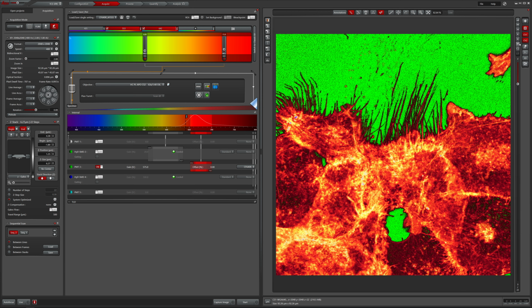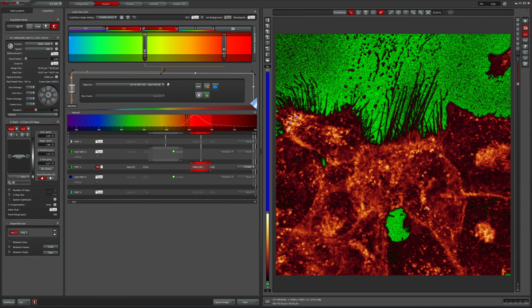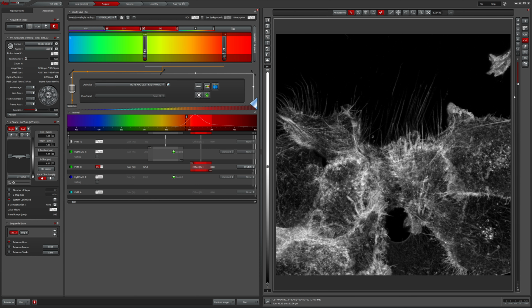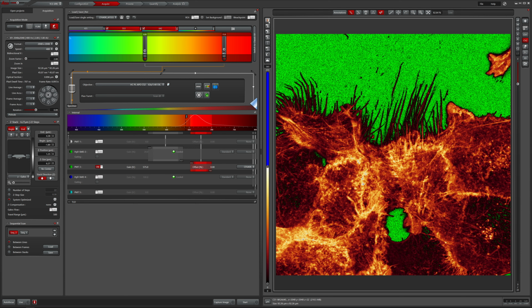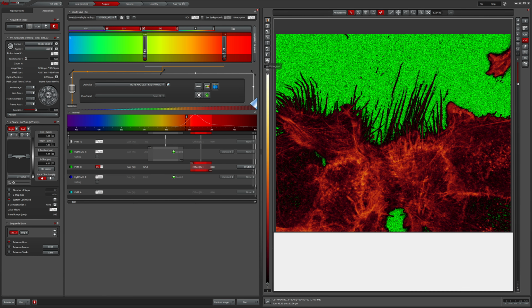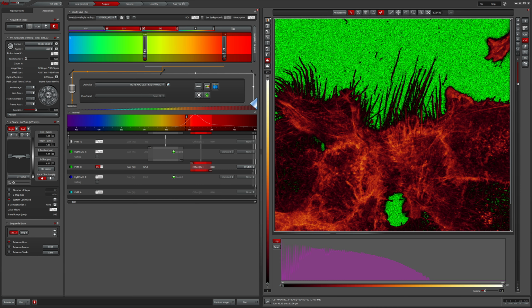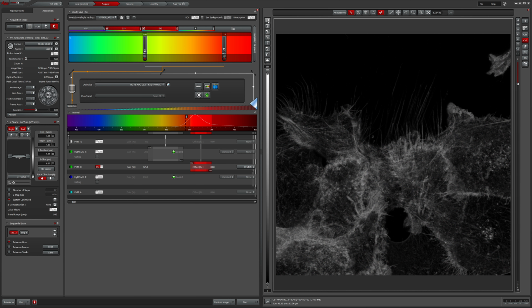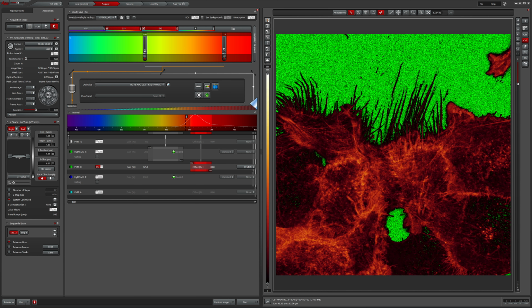You can instead look at one of these, like maybe just channel 1 or channel 2, and see if it's saturated anywhere. The answer is no. You could also check that with a histogram, of course. So this button up here toggles between grayscale, your pseudo color of choice, and the high-low lookup table.